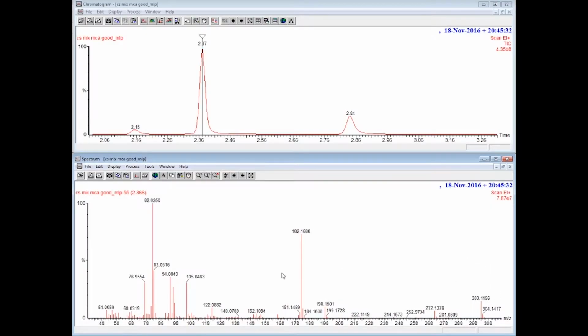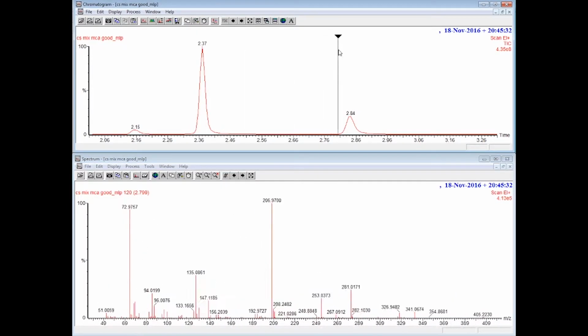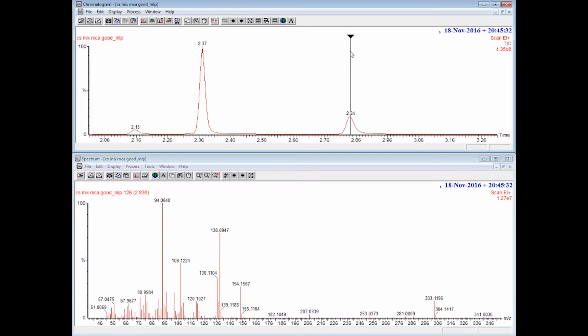Now in LCMS, we tend to get intact spectra, but look here, this is for cocaine, which has a mass of 303, and we have a peak at 303, but we also have a bunch of other peaks. Here's scopolamine, which has a mass of 303, and a bunch of other peaks. These are fragmentation spectra. So we're going to get information about the mass of the compound and potentially its fragments if we have a fragmentation spectrum.